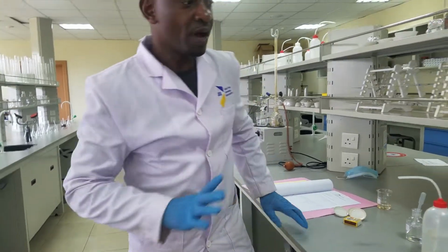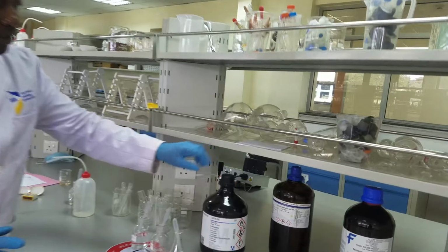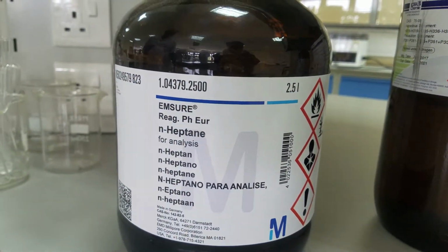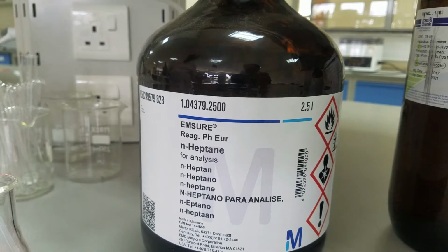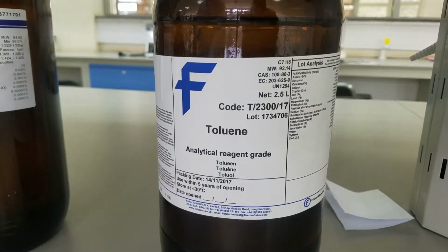So for the first part, we are just going to test hydrocarbons, and we are testing only 2 of them. One is an alkane, and the name is heptane. Remember, heptane means it has 7 carbon atoms. Then the other one is toluene.